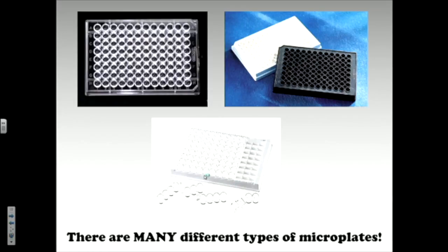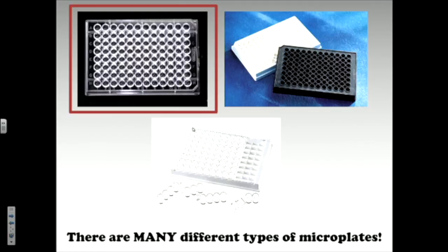And that's especially nice because sometimes you're doing things like ELISAs, which you might hear about next week possibly. ELISA kits a lot of times come with a plate that's pre-coated with antibody. And antibody is expensive, and you don't want to just waste a whole plate that's coated with antibody. So if you can save it, use it next time. Just take the strips out, put them back in the fridge, and only use the ones you need.